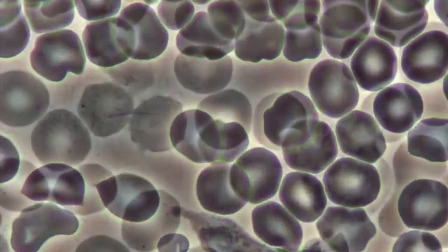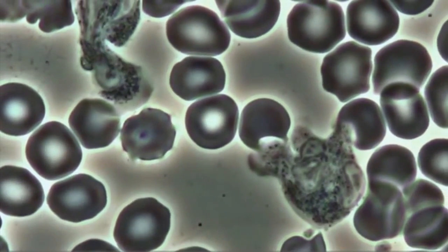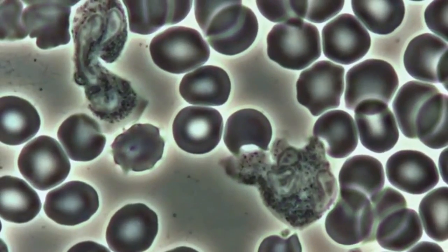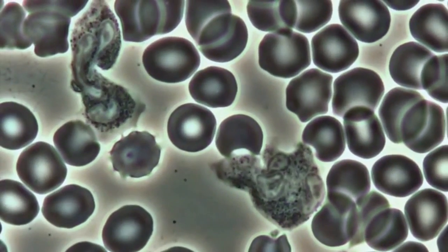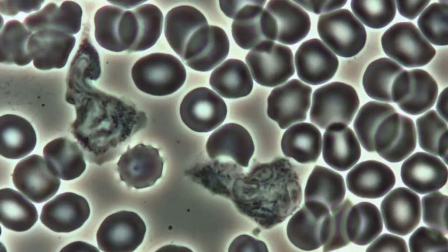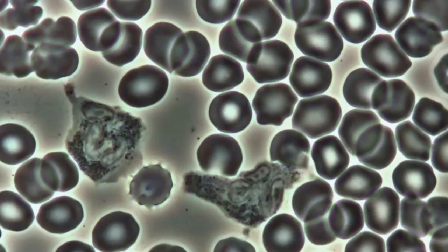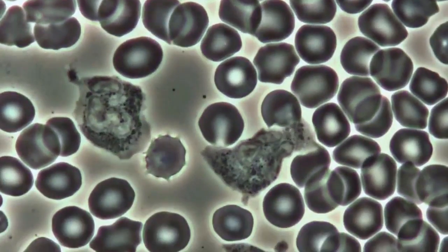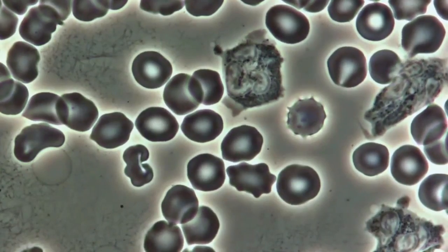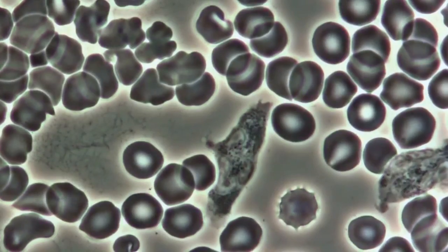In this second video, you can see a red blood cell infected by mycoplasma with the characteristic bumps. Two macrophages are attracted to the infected cell. As one macrophage is aggressively moving towards the cell, it is joined by another macrophage. The second macrophage is immediately repulsed from the mycoplasma-infected red blood cell. The first macrophage makes another attempt from a different direction. Eventually, both macrophages move quickly away from the mycoplasma-infected red blood cell.